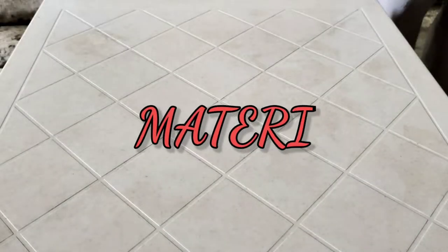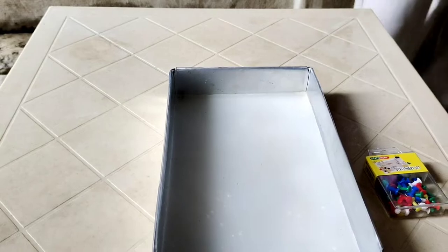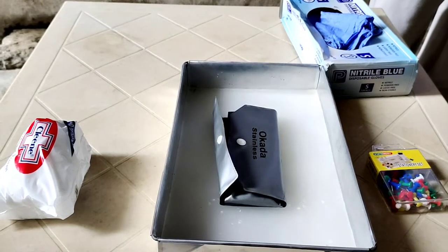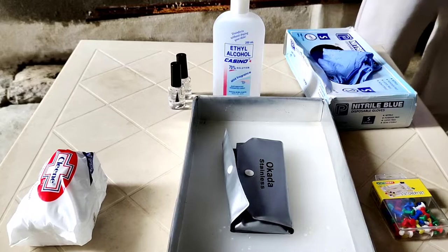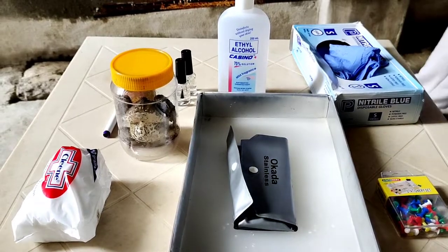For this experiment, we will be using the following materials: pushpins, dissecting pan, cotton, dissecting kit, surgical gloves, alcohol, nail polish, a marker, and of course, our frog specimen.